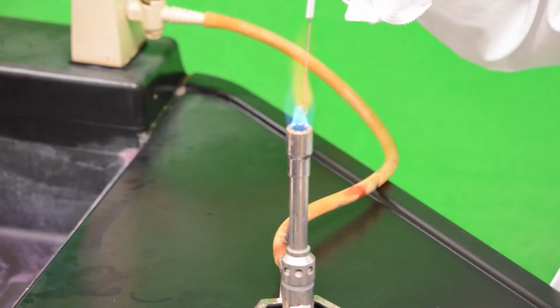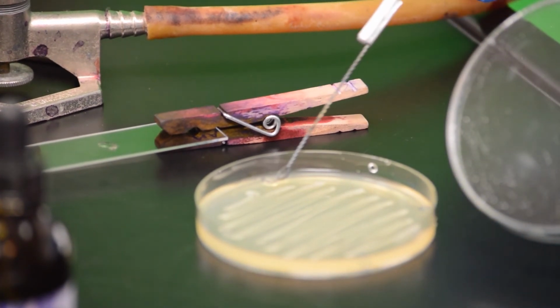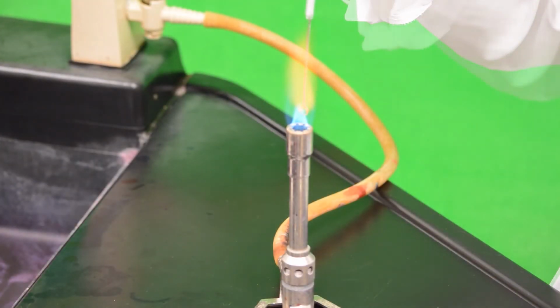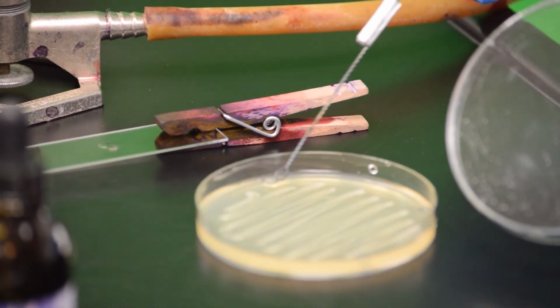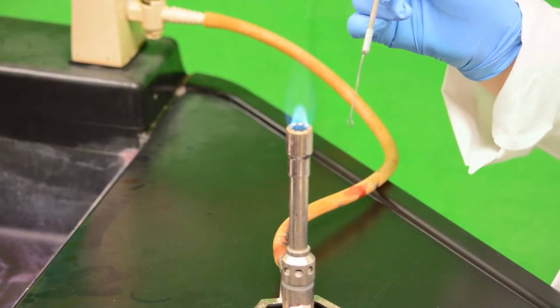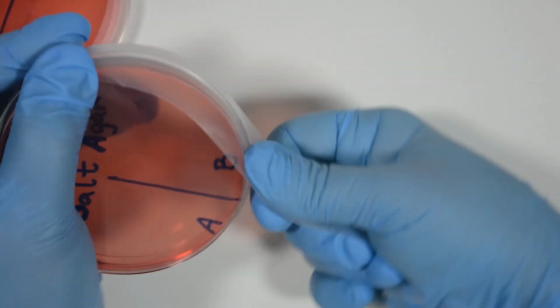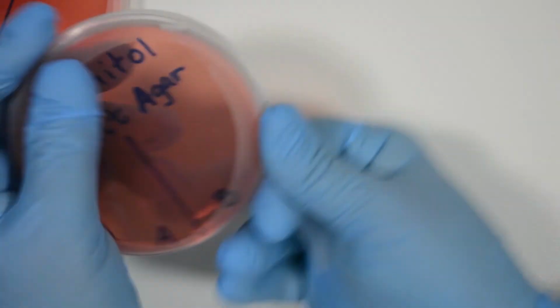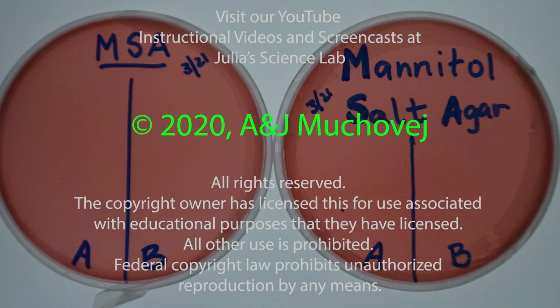If we are using a sterilized loop, we would use the same standard procedure we've done before. First, flame the loop, let it cool, pick up a small amount of one sample, then inoculate it on the MSA. Flame the loop again and let it cool down. Pick up a small amount of the other bacteria, then inoculate it on the MSA. Flame the loop again and let it cool down. The loop can now be stored and the plate sealed with parafilm. Invert the plate and incubate it upside down for 12 to 24 hours to see the results start to show. We're going to incubate this on a light box so we can film the growth.